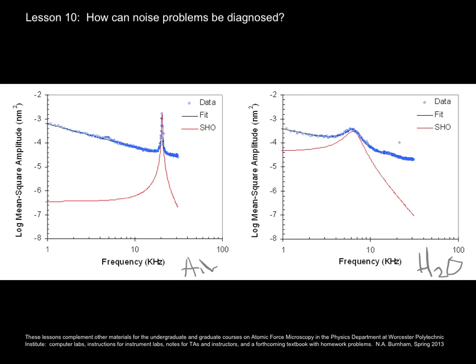Note that in the air signal, it's very clear that we have 1/f noise, as you would expect at lower frequencies. When frequencies are small, the 1/f is bigger. So if we look from 1 to 10 kilohertz, we have a change of 1 here and 1 here. So -1 here, and so this slope is indeed -1, which again, as mentioned before, is 1/f noise.